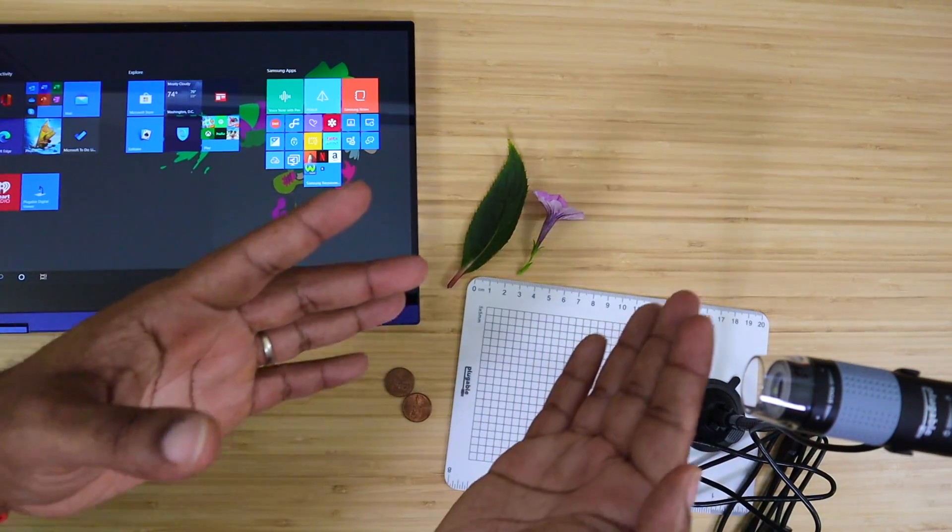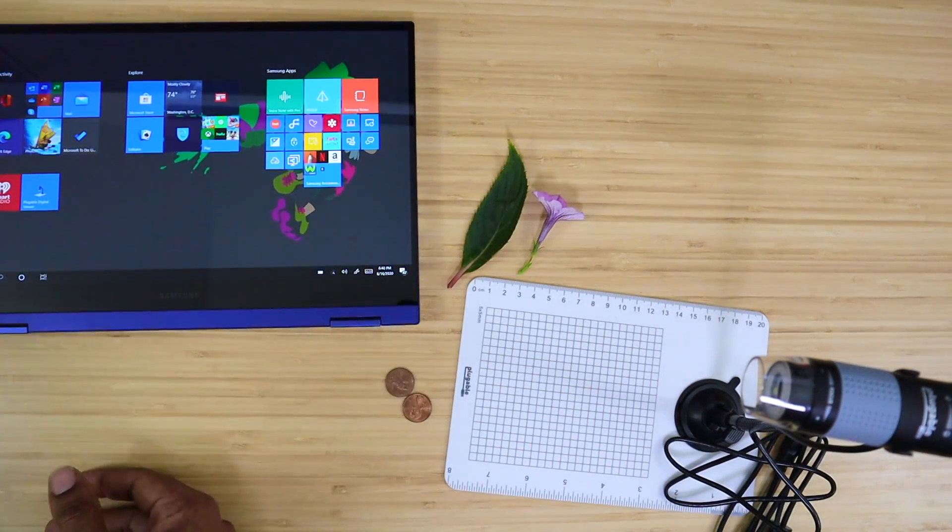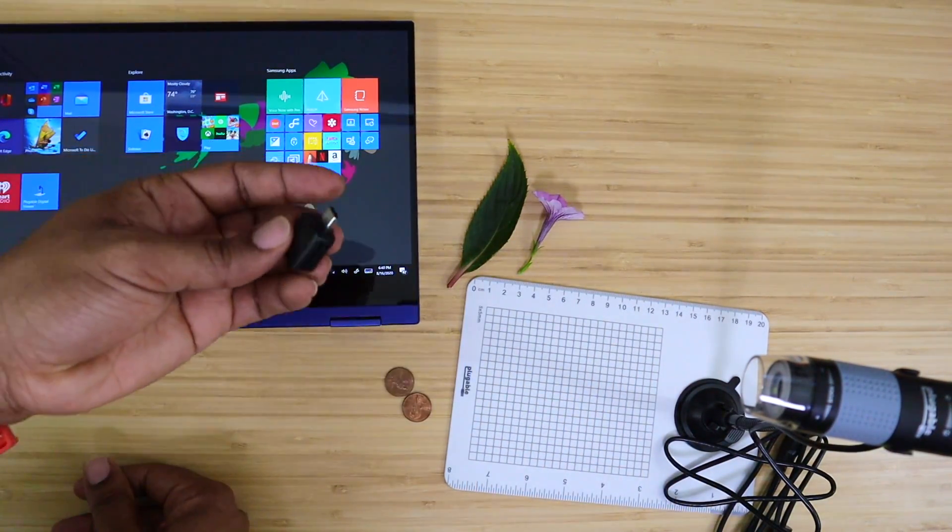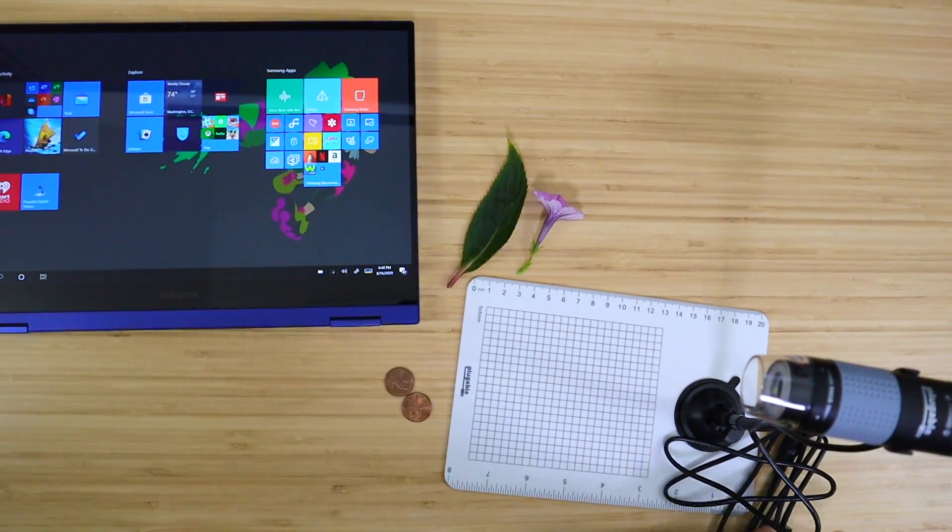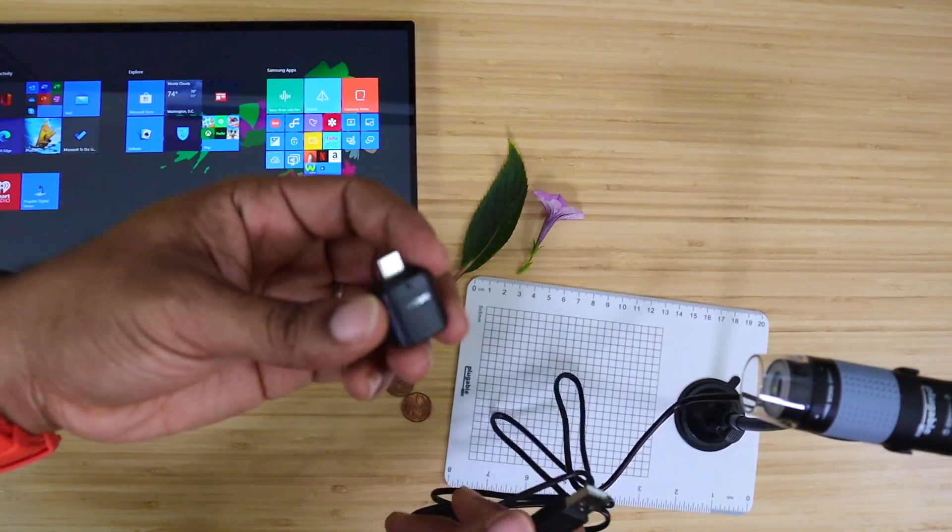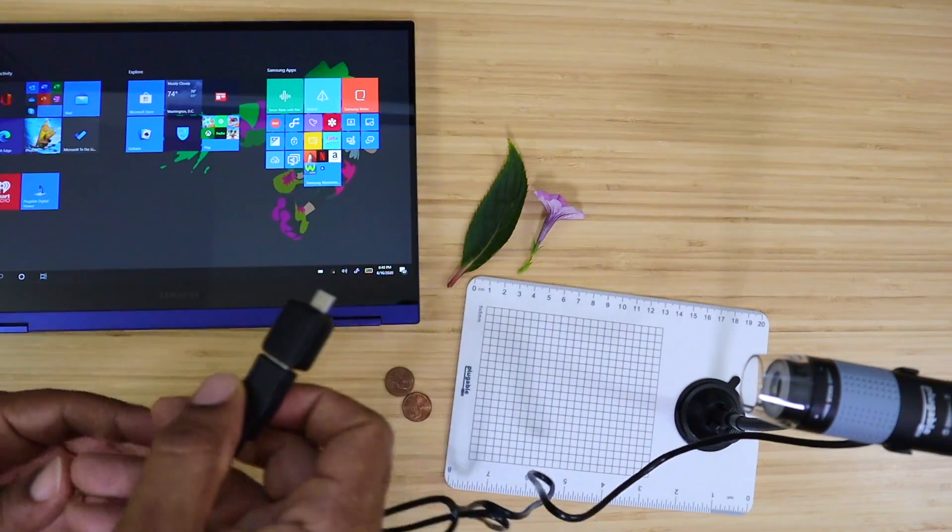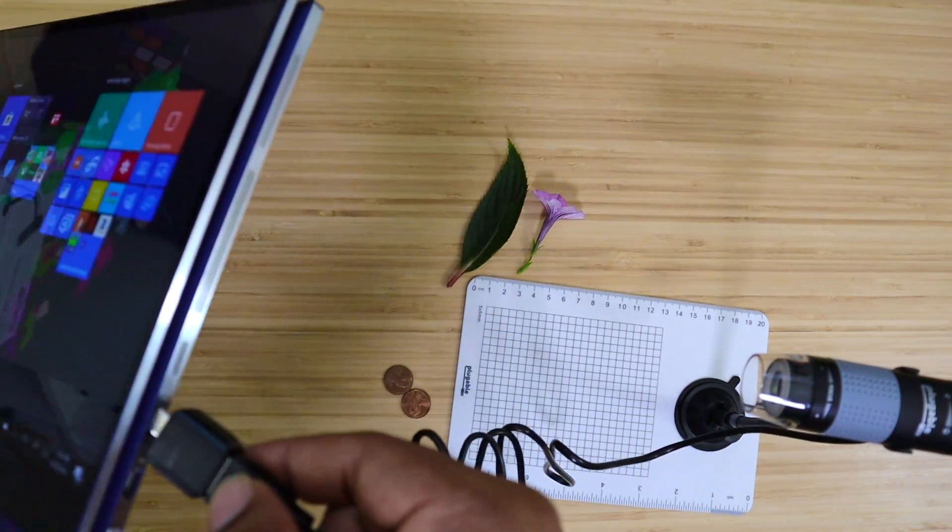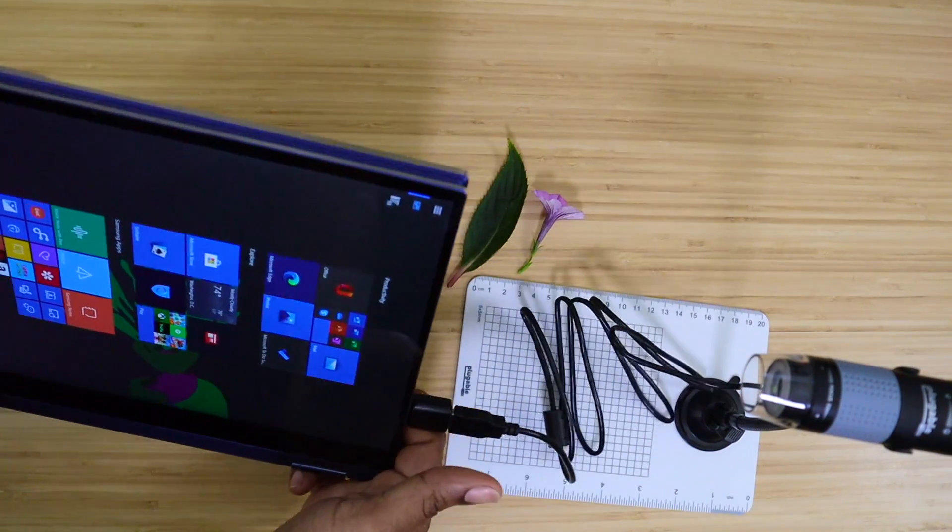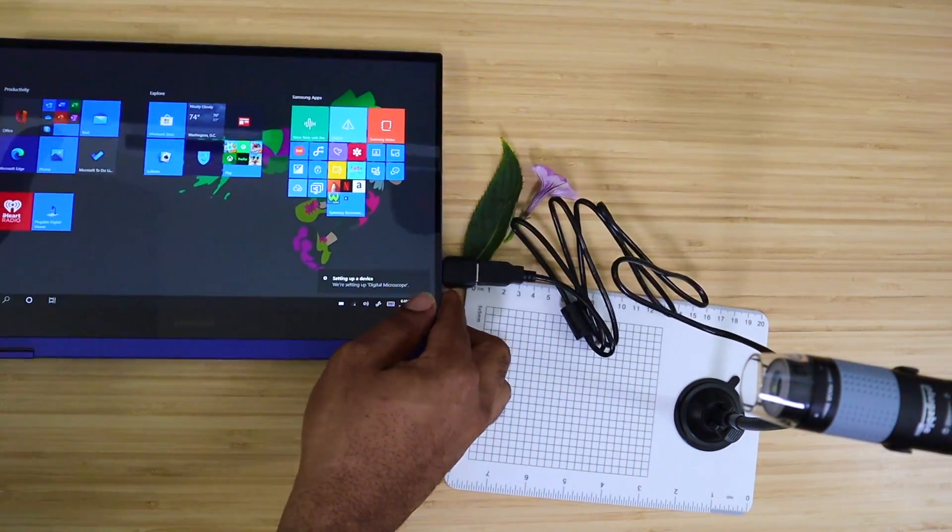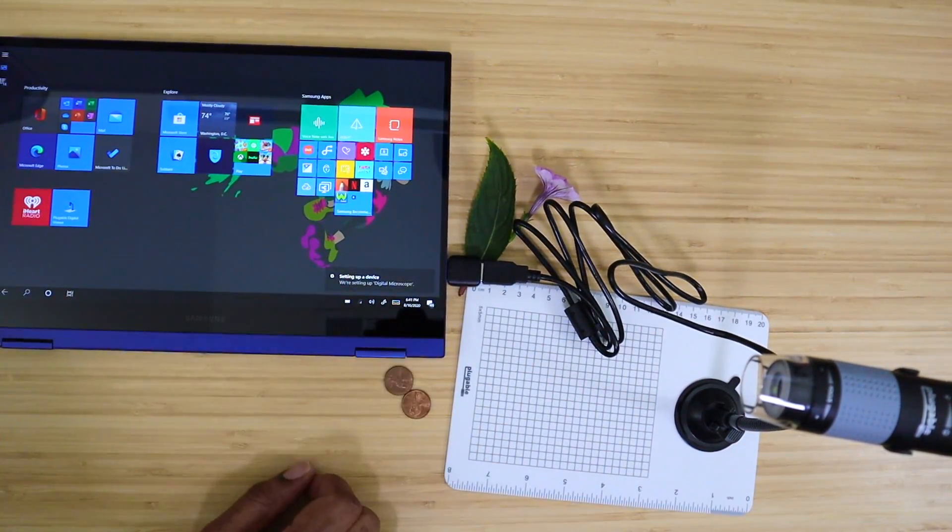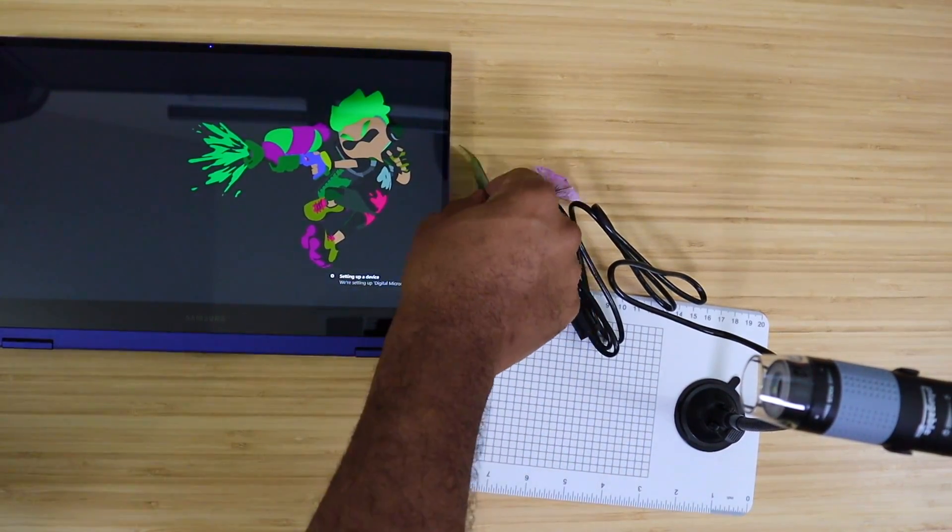We actually have a few things right here that I've laid out. We're going to be looking at those, but first I have to make this compatible with this device. I got an OTG adapter, Samsung OTG, and I'm just going to plug it into the side. Get this going and open up our application.